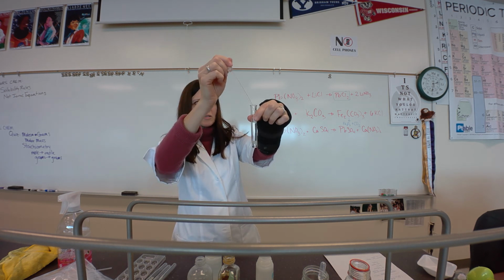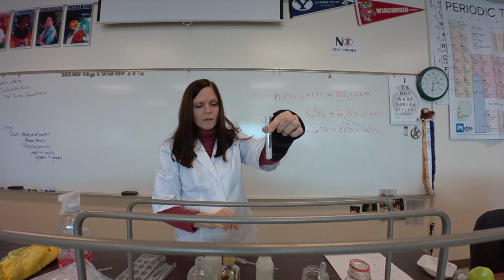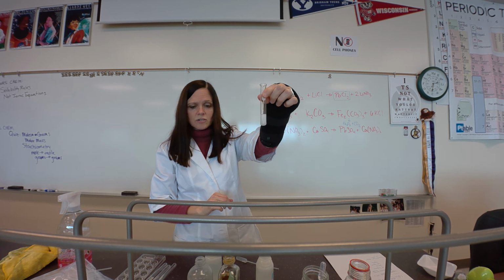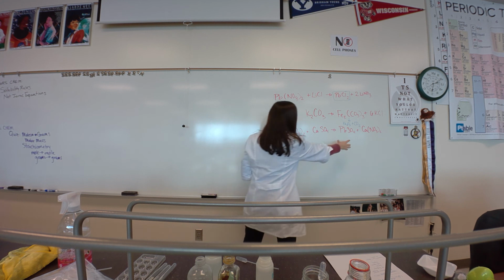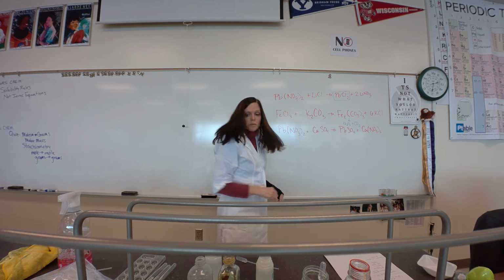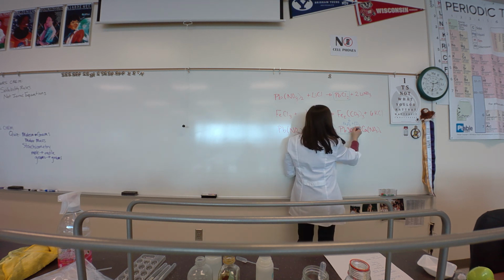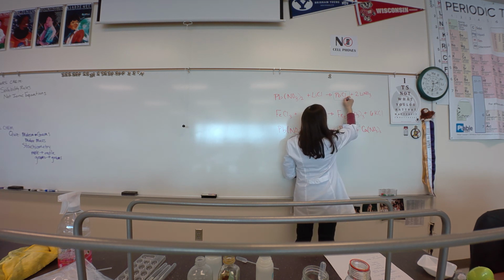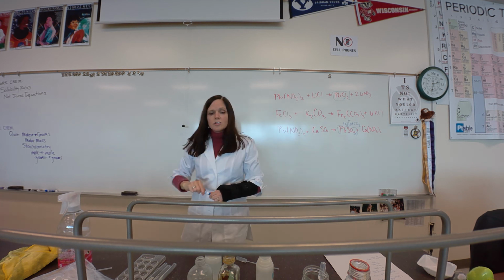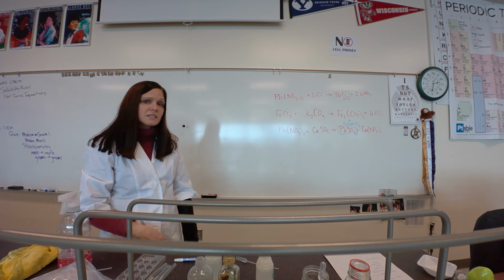Do you see how that turned cloudy? We are definitely getting our precipitate there. Okay, that's another good reaction that turned nice and cloudy. So what we would predict, sulfates are really not soluble. So we would expect that precipitate to be the lead II sulfate there. So we would expect that to be the solid, this to be the solid, and this to be the solid that we've seen. So we can use our solubility rules to predict precipitates that we see.